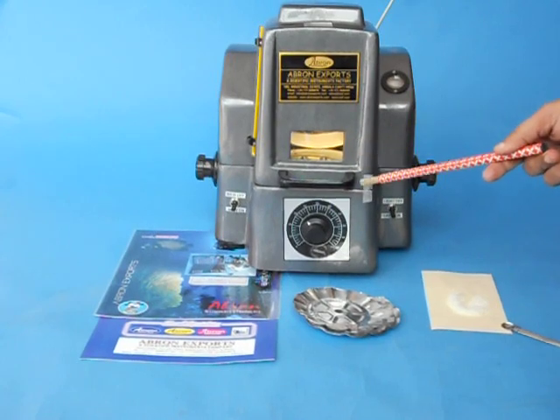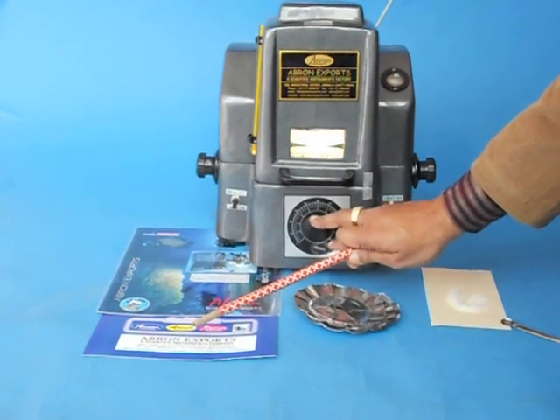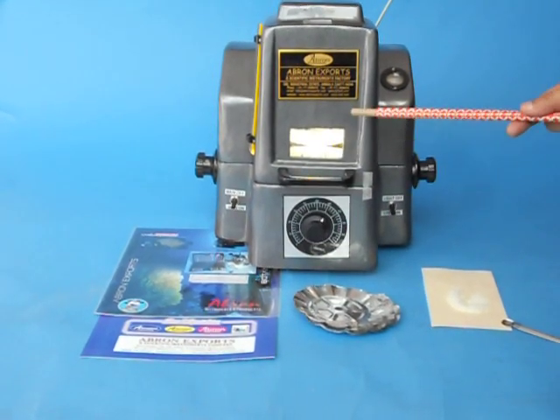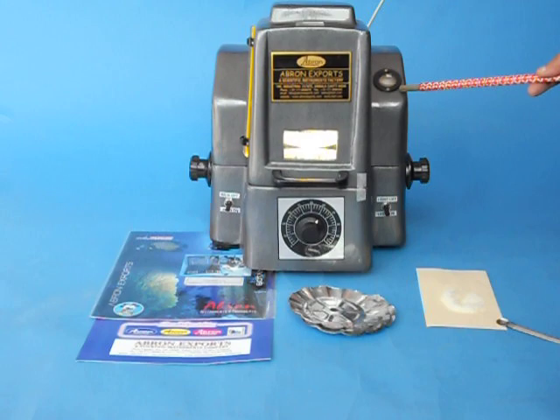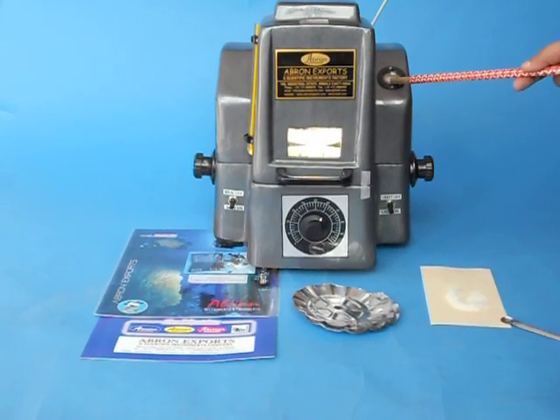After 5-10 minutes the moisture will evaporate. This can be kept at 6 or 7. After moisture evaporates, after the time as per your book, you can adjust this scale back to 0, coinciding with the indicator.